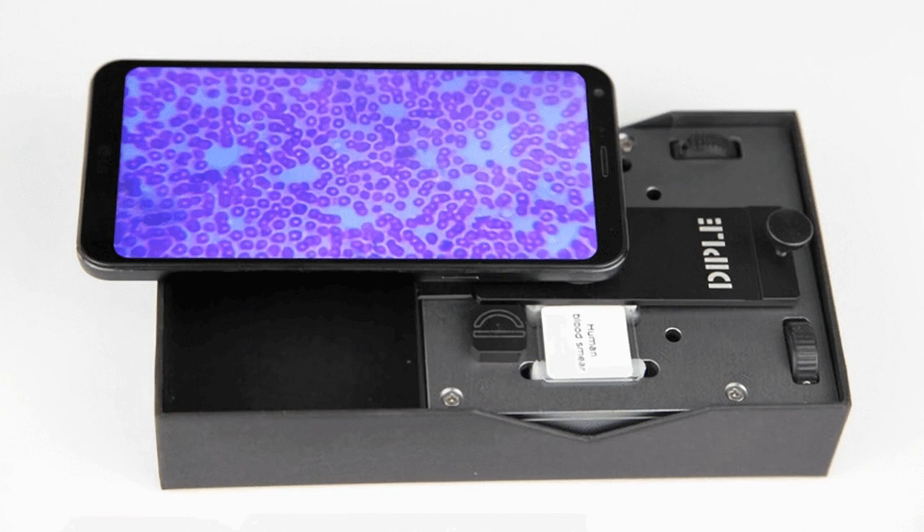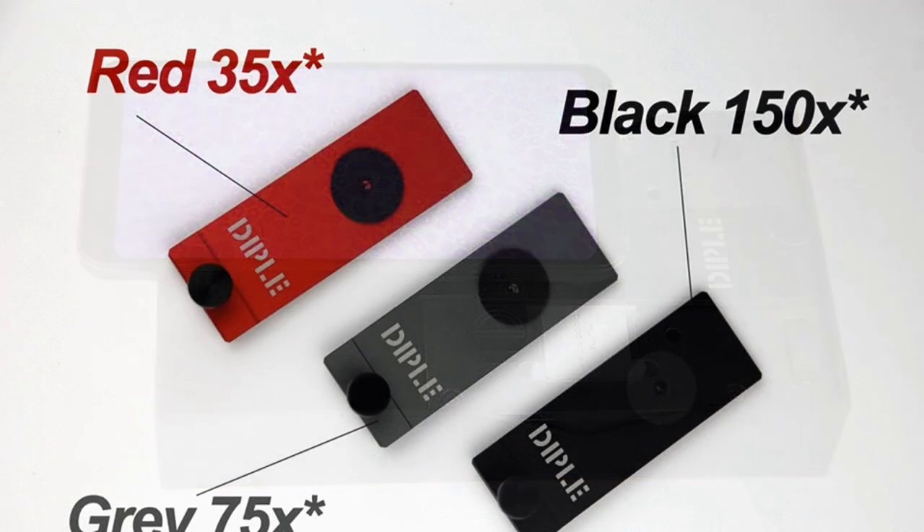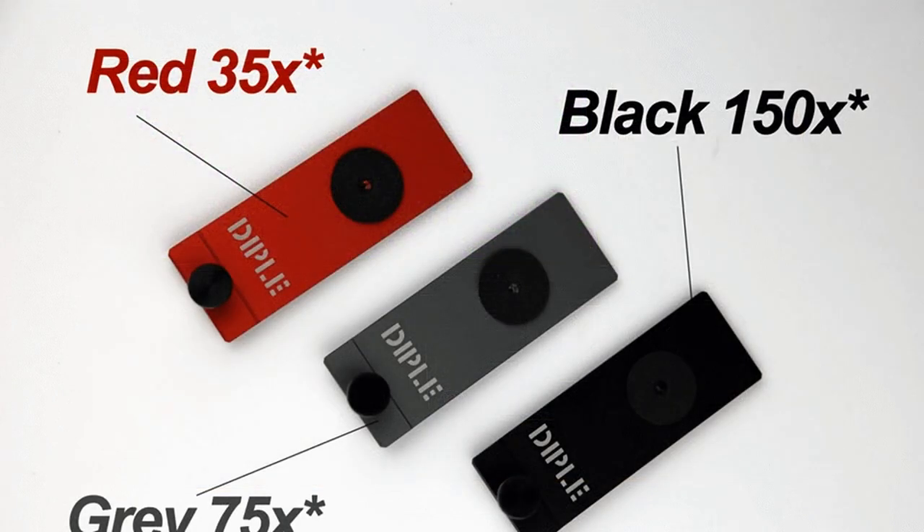Now a firm called Smart Micro Optics, SMO, has launched a Kickstarter campaign to transform your smartphone into a microscope. It has already more than doubled its goal of $27,688 by raking in over $61,000, with 26 days still left.